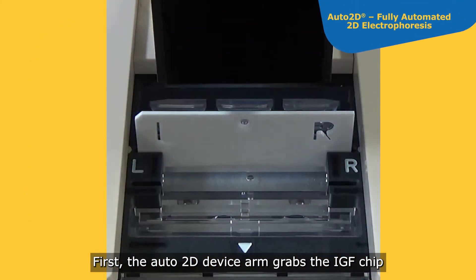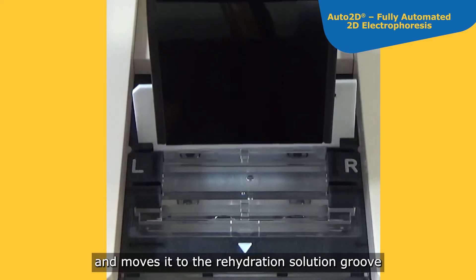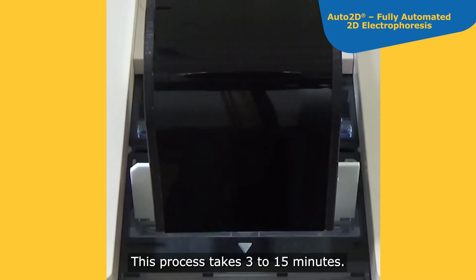First, the Auto2D device arm grabs the IEF chip and moves it to the rehydration solution groove to rehydrate the IPG gel. This process takes 3 to 15 minutes.